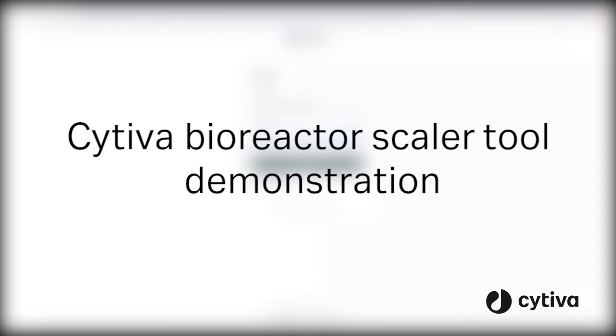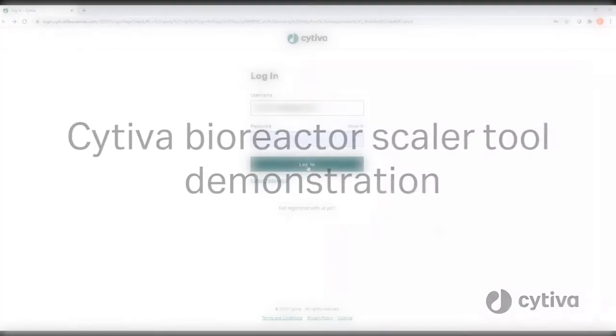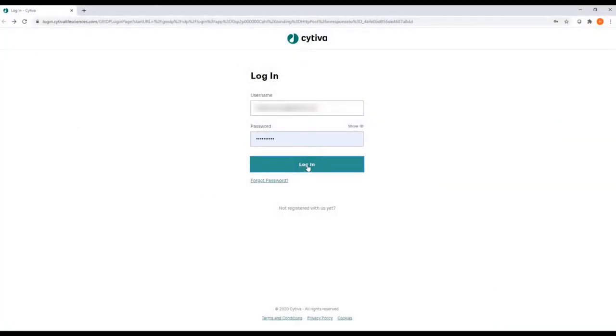Welcome to a short demonstration of the Cytiva Bioreactor Scaler. The first step is to enter your user credentials in the login page.